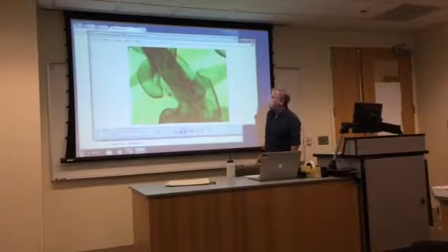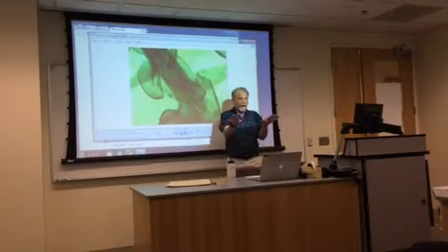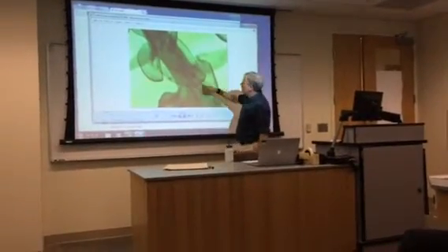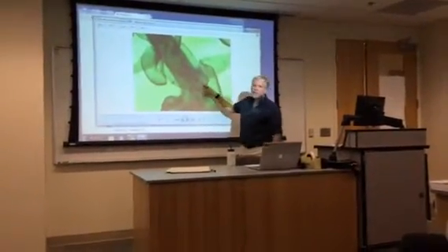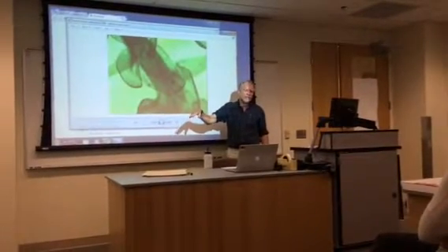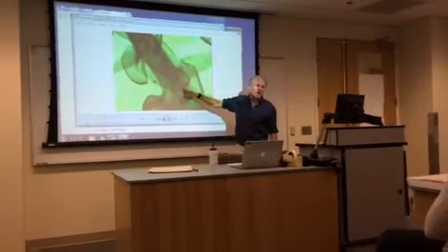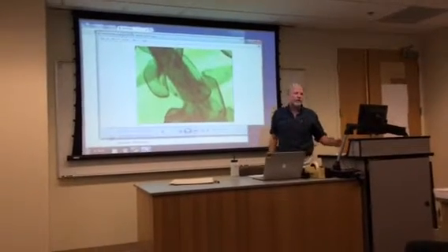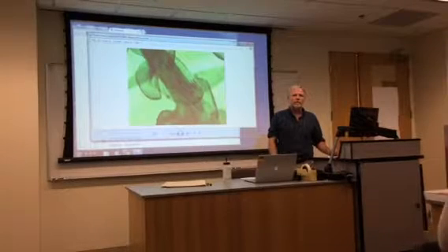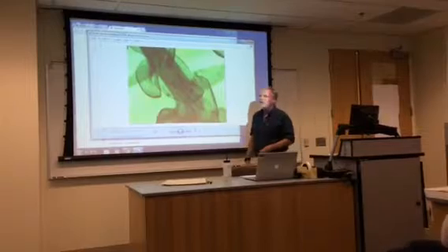Okay, but it's a little busy here because this is really just a lobe of this leaf. So the leaves stick out in 2 directions, but it's like they have a thumb or a lobe. And then there's a third set of leaves, that's this one here. That's perpendicular to the other 2, and it's on the underside of the stem that's laying on a rock or something that's moist. Those are called amphigastria. What does gaster mean in Greek? Stomach. Gastric indigestion, right? So gaster, remember that for the belly.